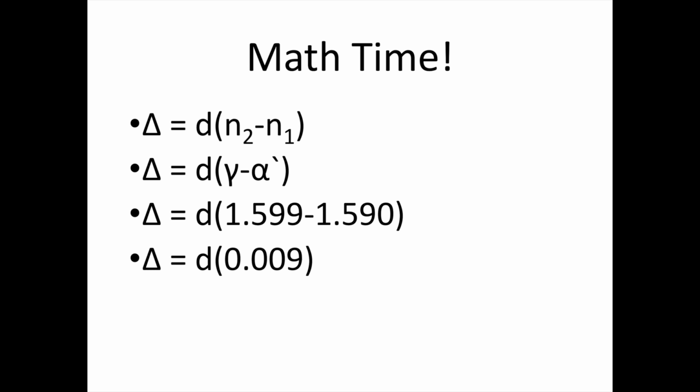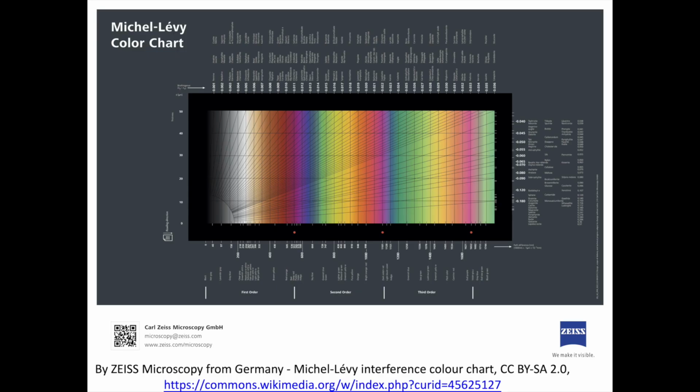interference color. In our previous video on variable thickness muscovite sheets, we used our interference color and a tool known as the Michel Levy Color Chart in order to calculate the thickness of the different areas of our variable thickness muscovite sheet. We'll do some different experiments with our oriented muscovite plates today, and we'll come back around to this at the end. Let's first see how our oriented muscovite plates interact with one another.